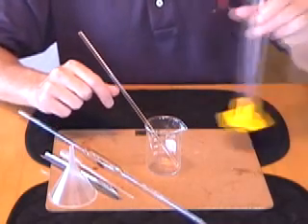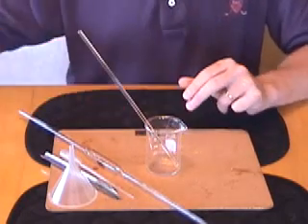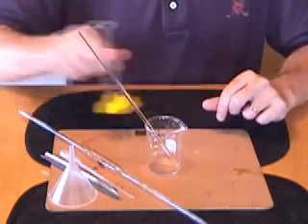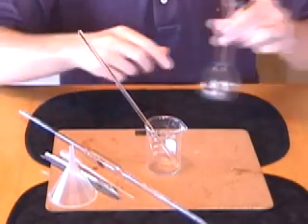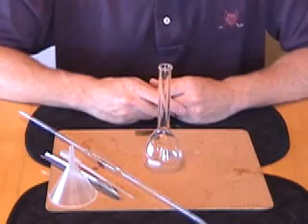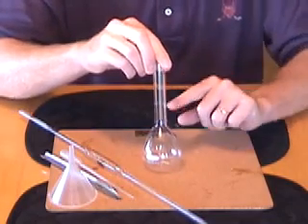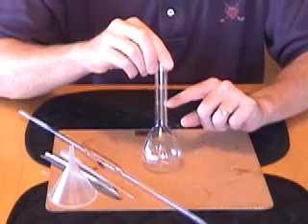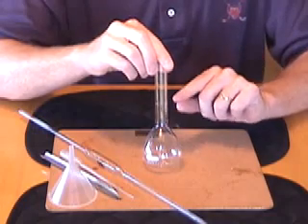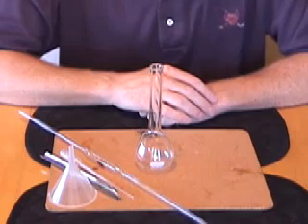So what's that? Well, how about a graduated cylinder? Nope, believe it or not, not accurate enough. Well, how about one of them little graduated cylinders, and we'll just do it quite a few times? No, that's even worse. Alright, what you need to use is this right here. That's called a volumetric flask, a 100 milliliter volumetric flask with only one line of measurement on it. That little line that you see there, carved around here, when the bottom of the meniscus of a solution touches the line here to within 2 decimal places, you've got yourself 100 milliliters. That's what you make a solution in.